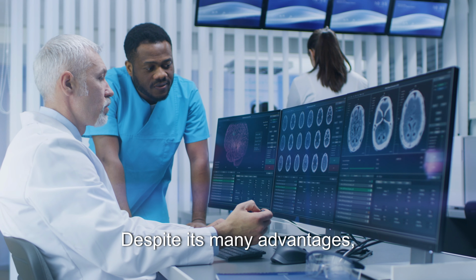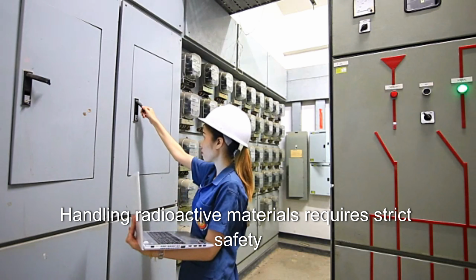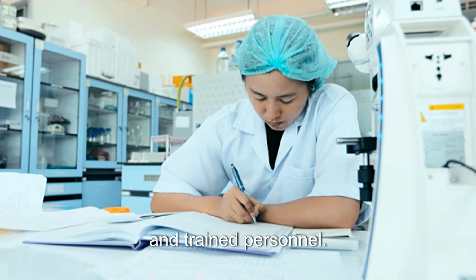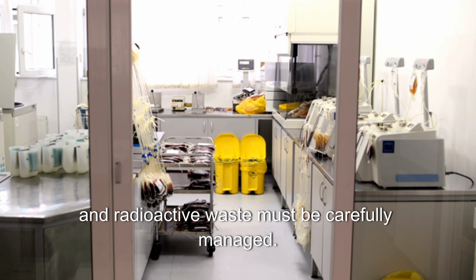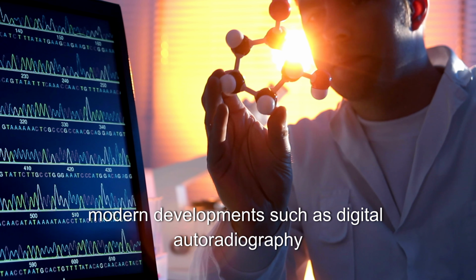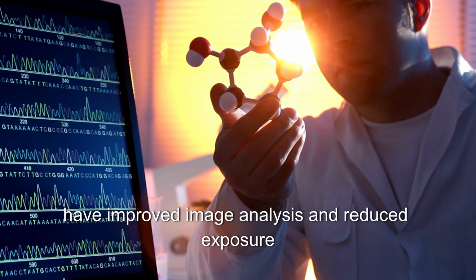Despite its many advantages, autoradiography has limitations. Handling radioactive materials requires strict safety precautions, specialized facilities, and trained personnel. The technique can also be time-consuming, and radioactive waste must be carefully managed. However, modern developments such as digital autoradiography have improved image analysis and reduced exposure times.